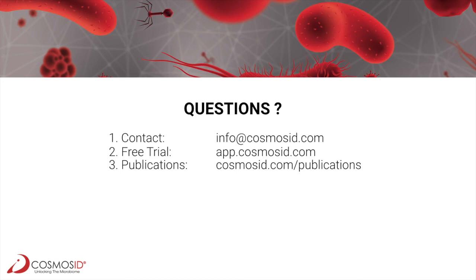Now, for diagnostic applications where sensitivity and the lower limit of detection are important, there is the possibility to carry out host DNA depletion experimentally. However, using this for microbiome analysis and microbiome studies is not advisable, as it will affect the composition of the skin microbiome samples. So for diagnostic applications where you try to sensitively detect a certain organism or group of organisms, host depletion is an option. For microbiome studies where you're seeking to understand the differences in composition, we advise against that option.